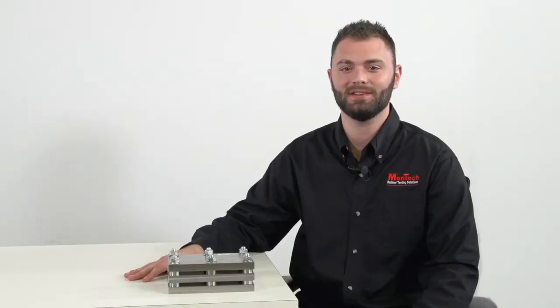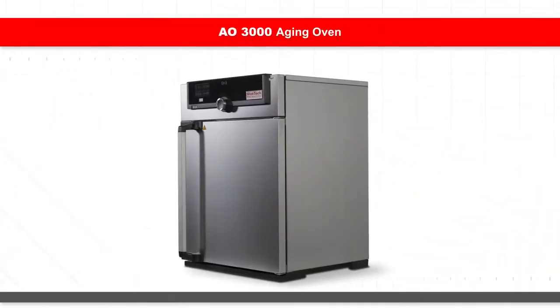CS3000 compression sets can be used with aging ovens like the AO3000 to test a material's performance under varying environmental conditions.